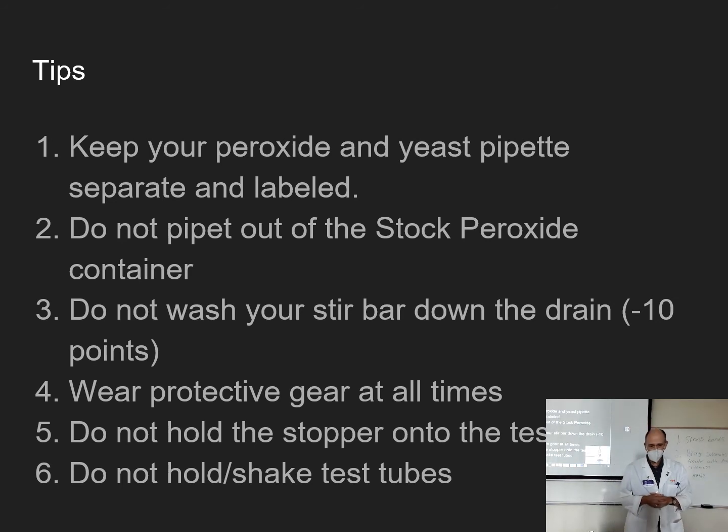Wear protective gear at all times. Also, when you put your stopper on your test tubes, don't hold it on the test tube. The stopper can pop off when pressure builds. It'll go pop like a cork gun, but that's good, because if you're holding the stopper on the test tube, then the bottom of the test tube explodes instead. We don't want to do that.